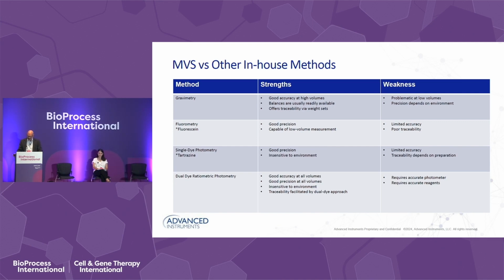Dual dye technology has good precision at all volumes, as we've said, good accuracy, and it's insensitive to environmental factors, as well as it has the traceability that is needed for many of the applications, and the software handles all of the curves and everything for you.